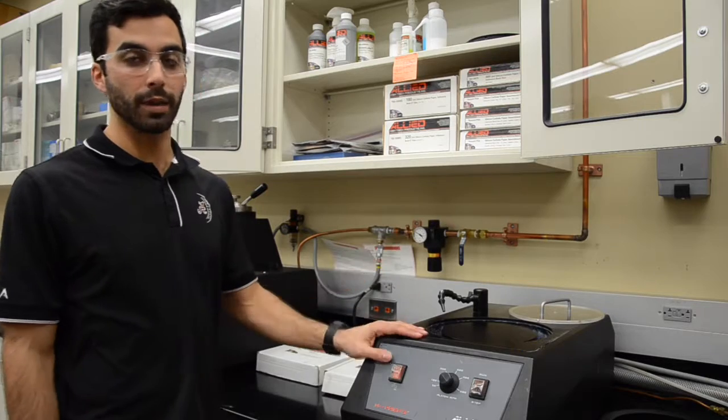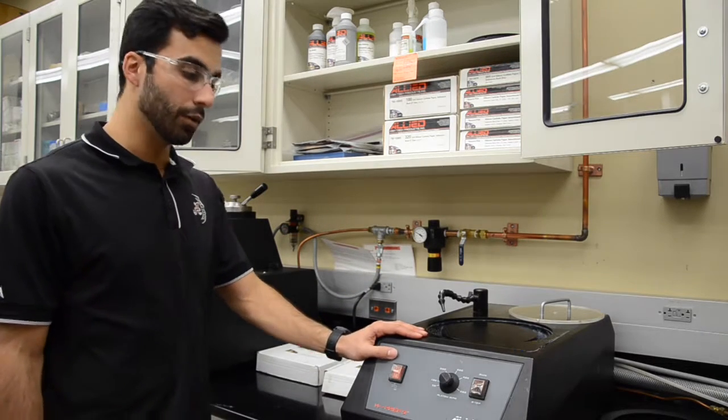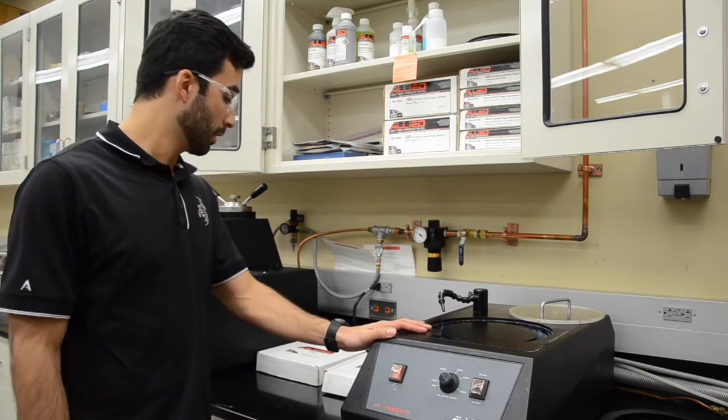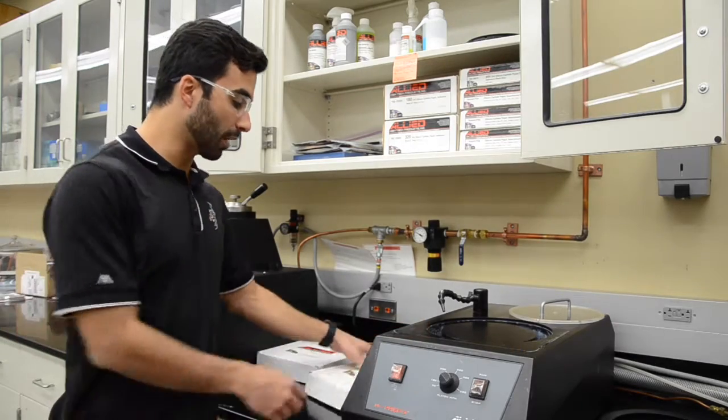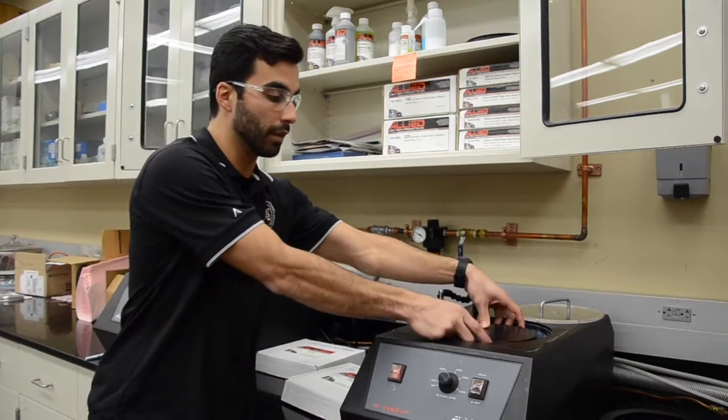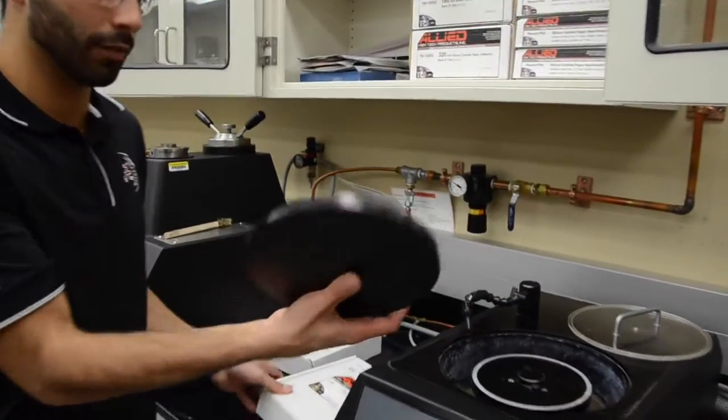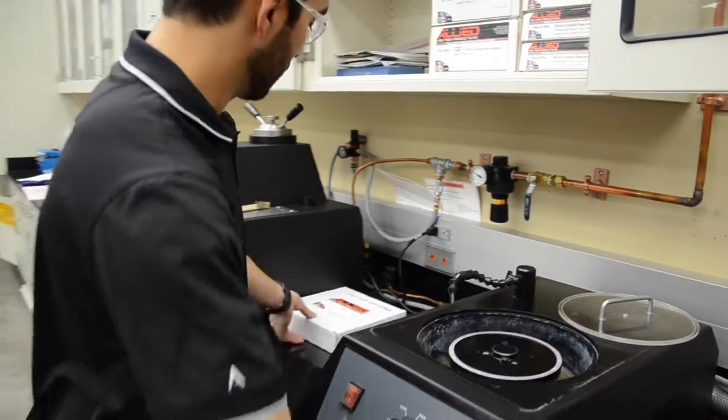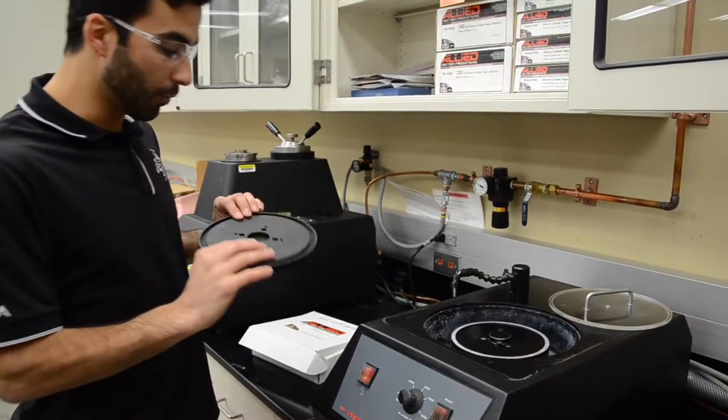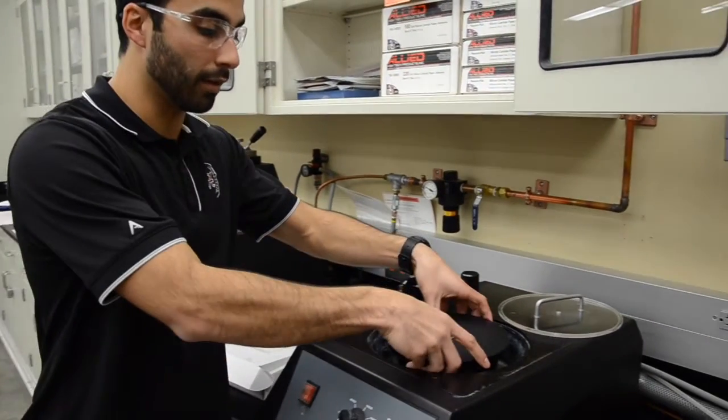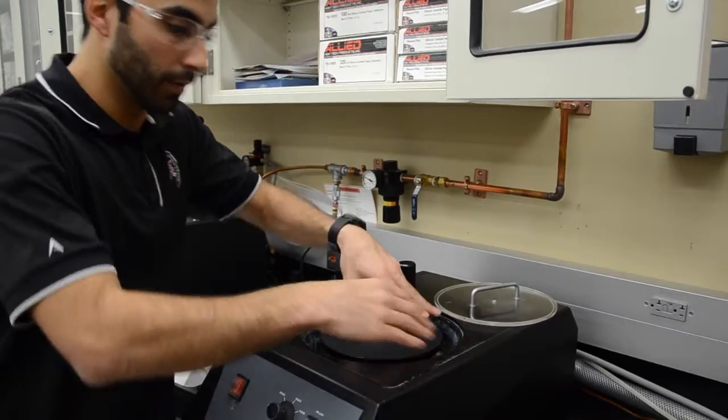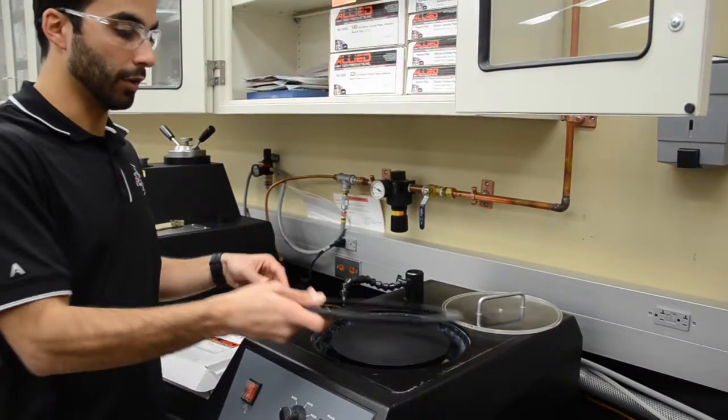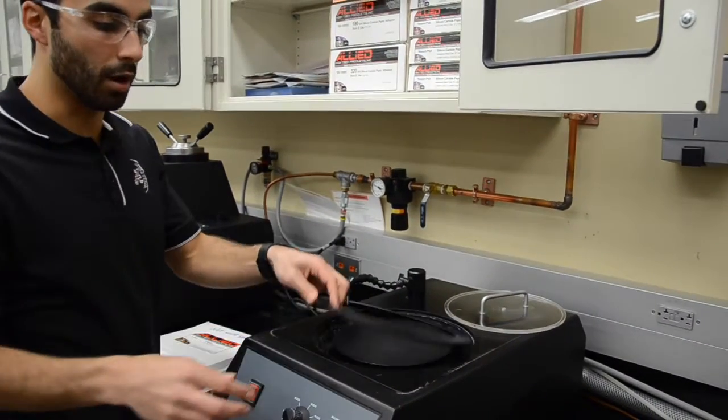Once you finish all the way your steps down to the 1200 grit, you're going to move to polishing. For polishing, we're going to swap the platens. We're going to take the one with sandpapers out of here, clean it and then store it. And then we're going to use the one that is not to be used with sandpapers and place it here the same way. The string comes in and out.